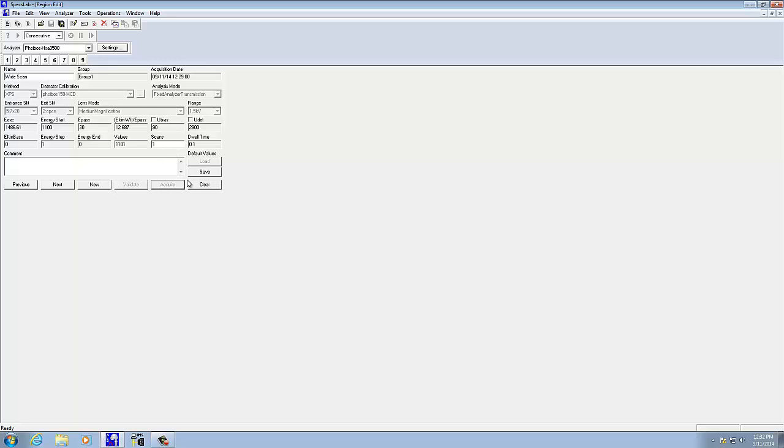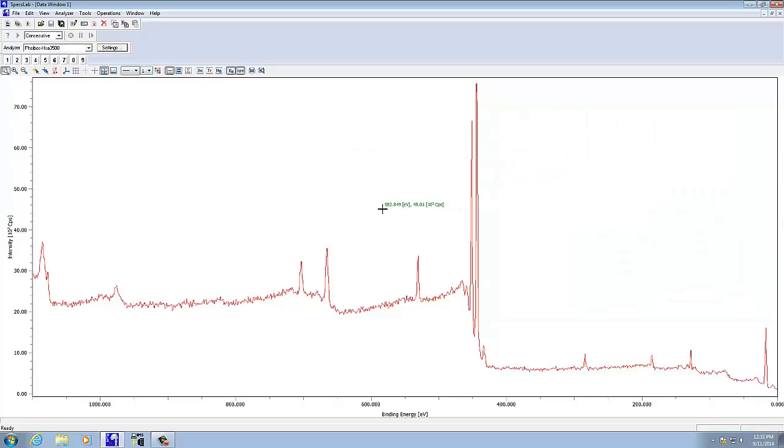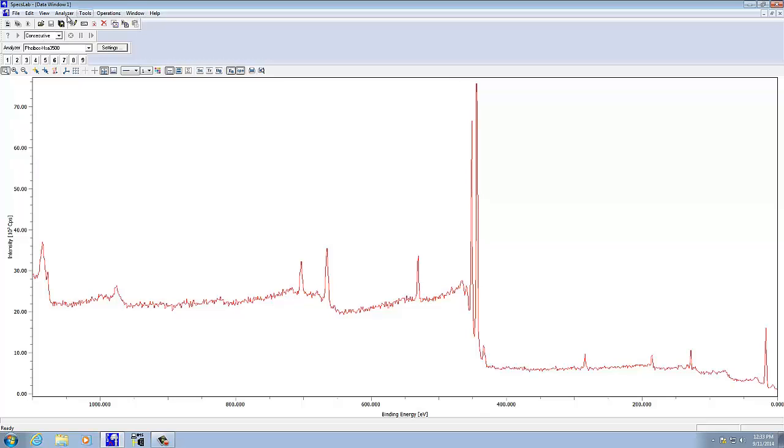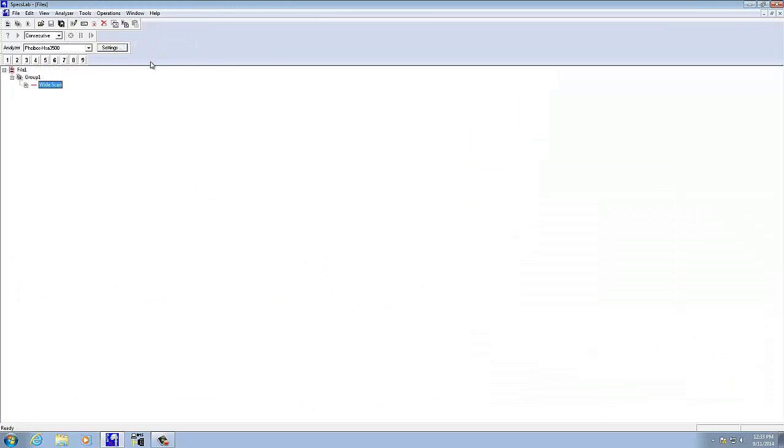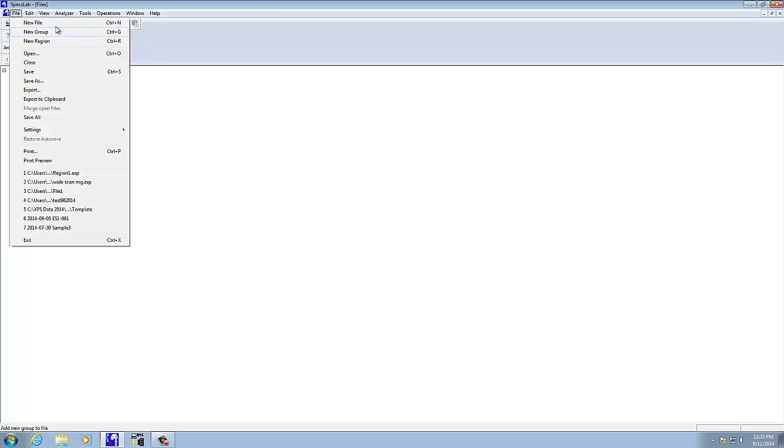If instead we're okay with what we have there, let me go back to the data window. Let's say we want to save this, or in particular, often we have to import this data into CASA XPS. To do that, we want to go to the window, files, and then here we can do a file, save the file, but if we want to use it in CASA XPS, what we need to do is change it to a .VMS file.